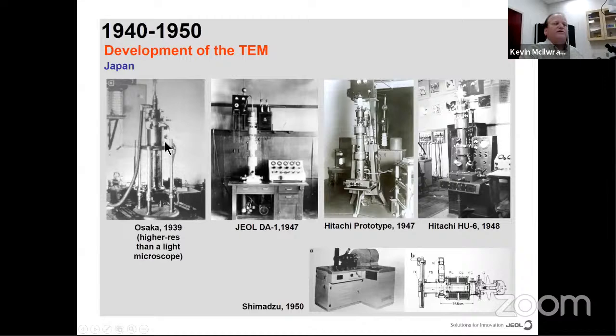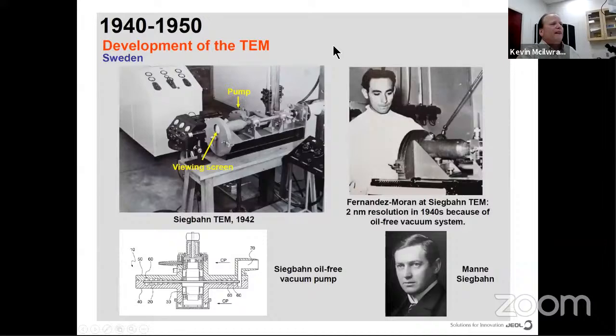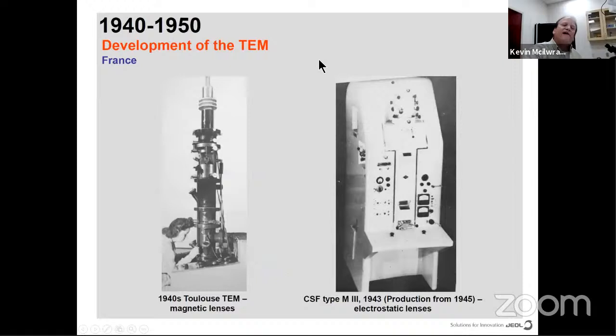And then we had all these other models, and these are just early types, Hitachi's prototypes. Actually, this program had one of these too, a later model. Sweden was also in the development of TEM. The UK, we've got France. So everybody was getting in on this in the 40s and 50s.